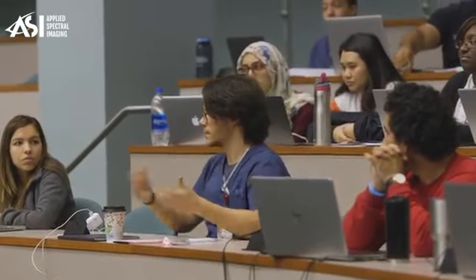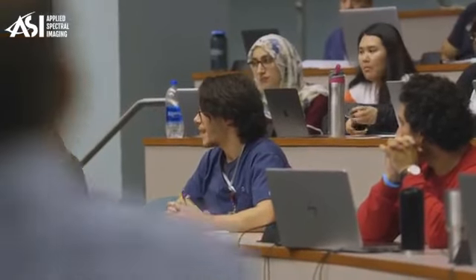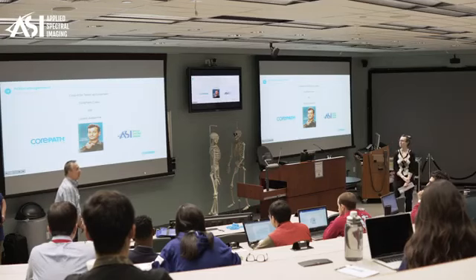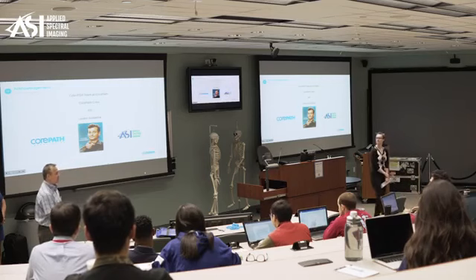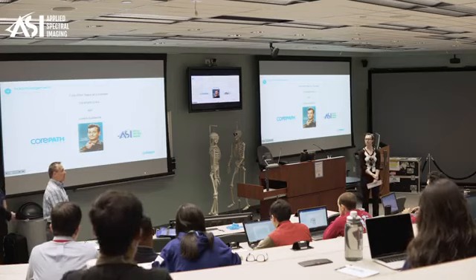With using the cloud, would there be any security concerns with things being in the cloud, like PHI and things like that? Our LIS is completely secure and HIPAA compliant, and so is the ASI system. The system has a security monitor within it, so the product itself is HIPAA compliant. The way it works is that you first have to have the capability of being able to enter into that laboratory's IT area.